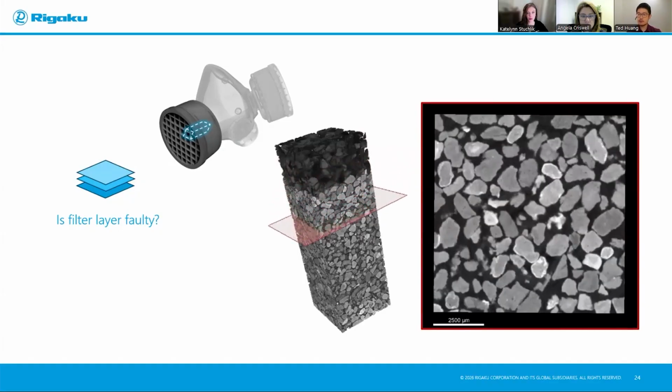And you don't have to resort to just one slice. You can also average them out, stack them together, to learn about the pass-through, because it may look very uniform, but when you stack everything together, you'll notice, oh, actually there are areas that have less density of certain particles, so that will create potential leakage or a weaker filtering channel that whatever toxic gas can pass through. And we don't have to just look at it in 2D again.